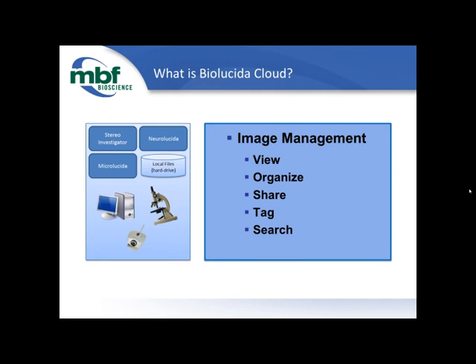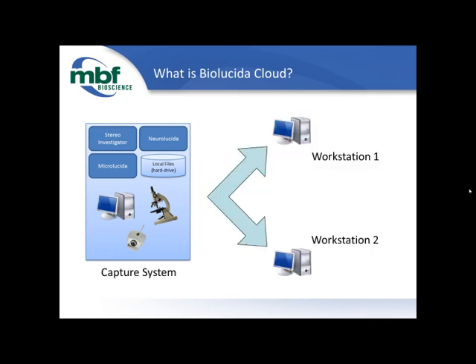Right, so you're talking about I'm sitting in front of my microscope and computer, I acquire an image, and now that image is saved on my local C drive, and now I'm going to work with that. Exactly. Now let's expand on that example a little bit. Jose, let's say it was you who created the 3D virtual tissue.